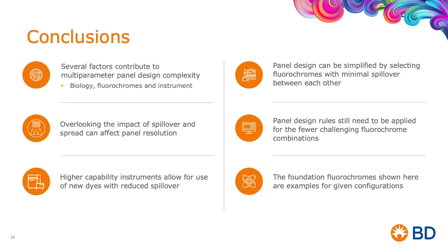It is very important to remember that even though the process has been significantly simplified by strategic selection of these fluorochromes, there are still a few areas of potential mistakes that need to be taken into account. Ignoring those will still have consequences on the panel. So that's why it's really important to have the foundation of panel design, understanding the rules, but in the context of a selected combination of fluorochromes, there are very few areas where those rules need to be taken into account.